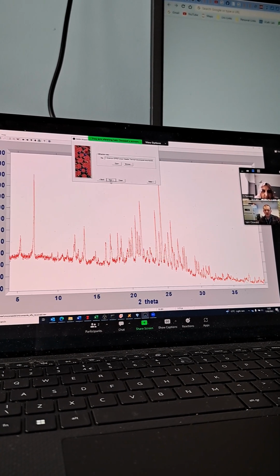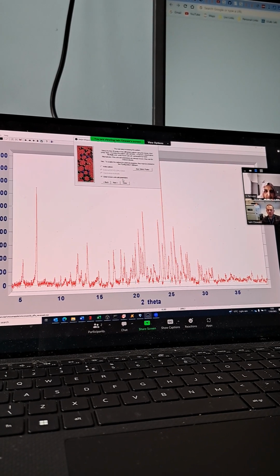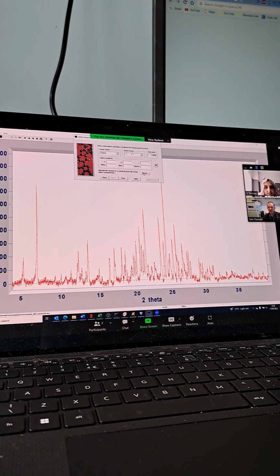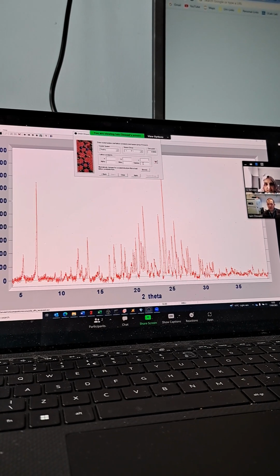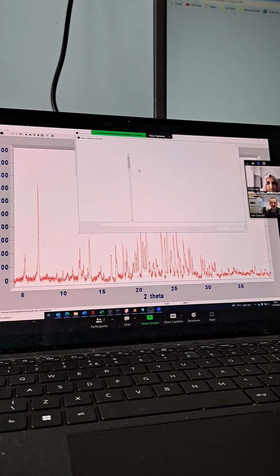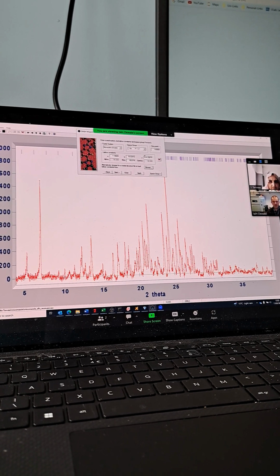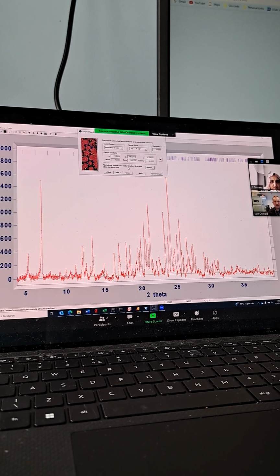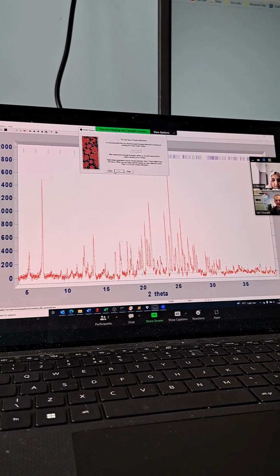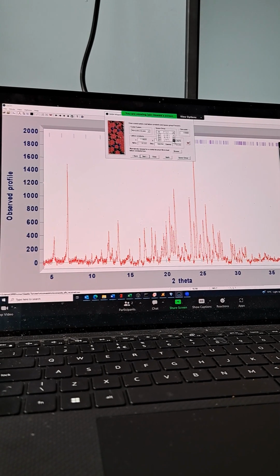Okay, so here's your file. We can click through most of this. What you'll want to start to do is add in known cell parameters, and then you can type in the cell parameters or copy and paste them into here. Now, what I will do is put in this, for example, PAVPIP. I don't know whether that's right or not. It doesn't look to be the right thing, but that gives us the unit cell parameters in here. And you want to choose the correct space group.